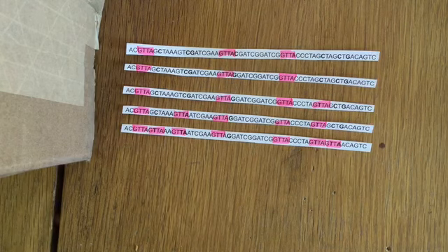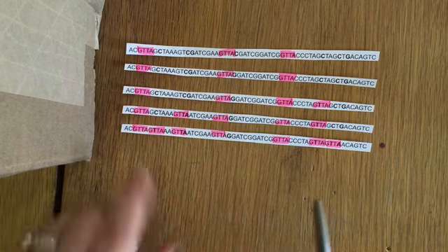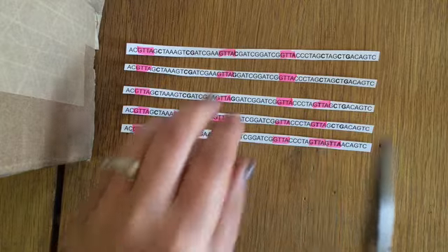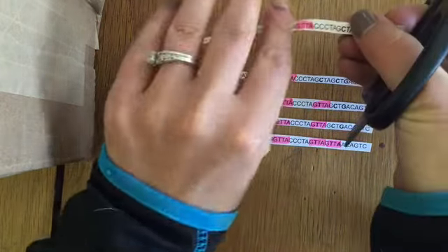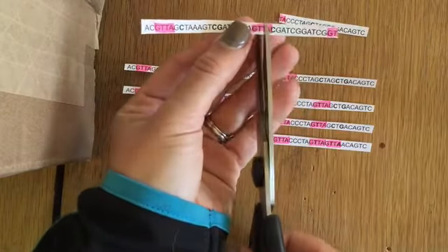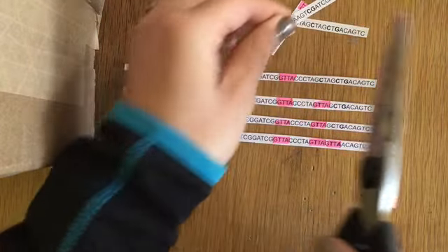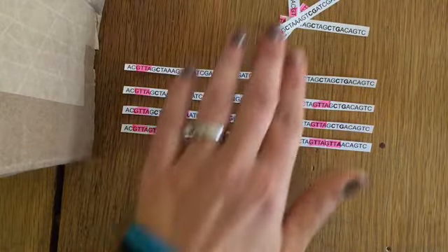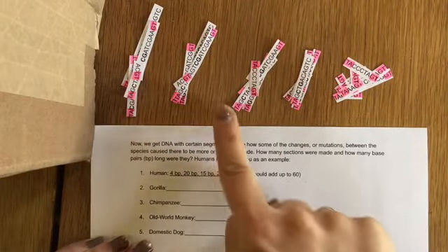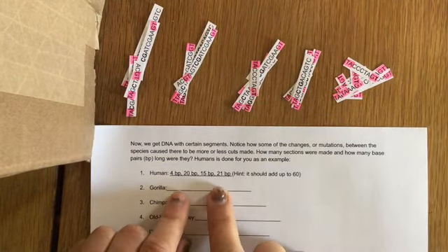So what happens next in the organism is scissors. So remember we said between the T's, that's where everything gets cut. So what those enzymes do when they break stuff apart is they physically cut our DNA into a little pile. Now through movie magic, we have our 5 different piles: human, gorilla, chimp, monkey, and dog, all cut appropriately. So what you get is certain segments.